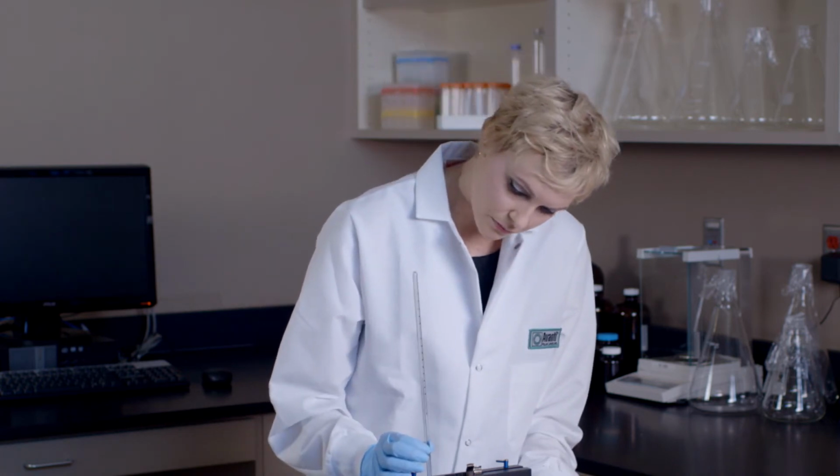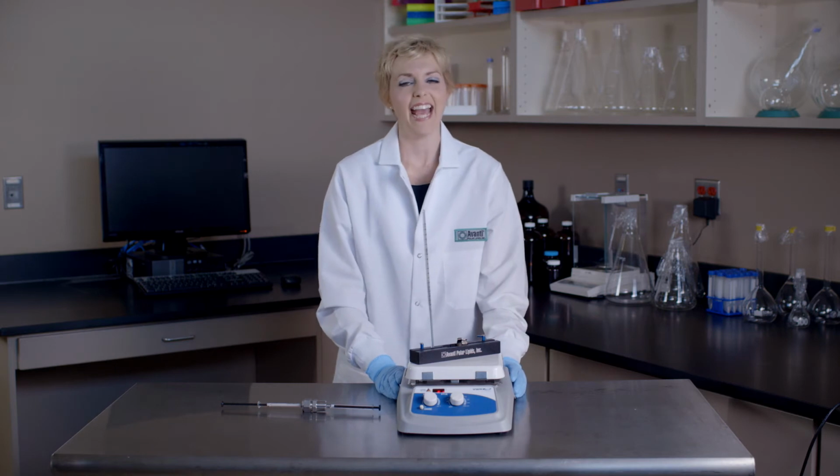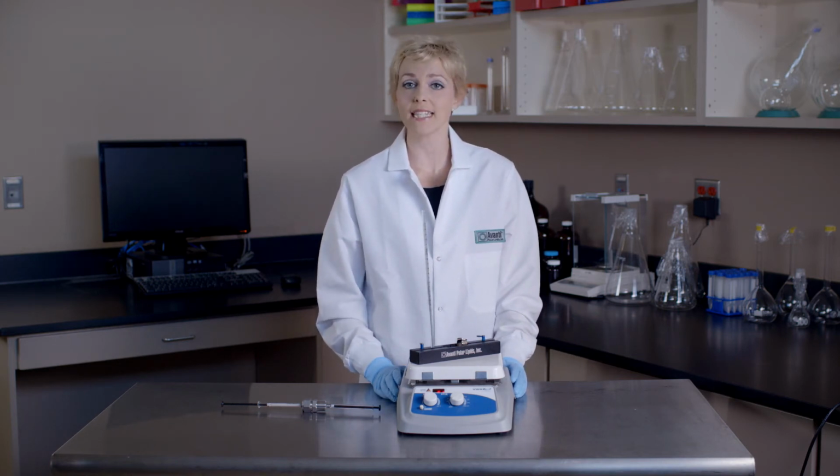Next, we need to check the temperature of our heating block. The temperature of the heating block must be below 80 degrees Celsius in order to prevent damage to the syringes. Looks like we're below 80 degrees. And now for the most important note. The extruder apparatus must be fully assembled prior to insertion into the heating block in order to prevent damage.